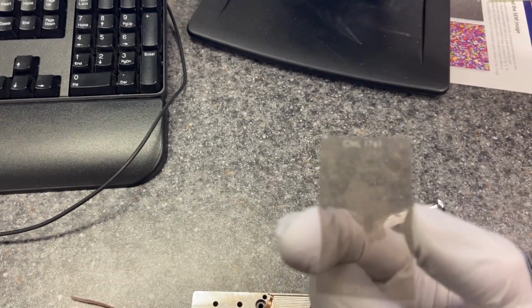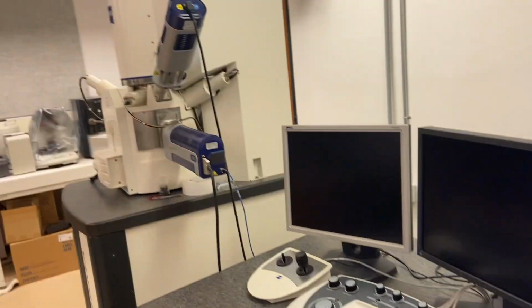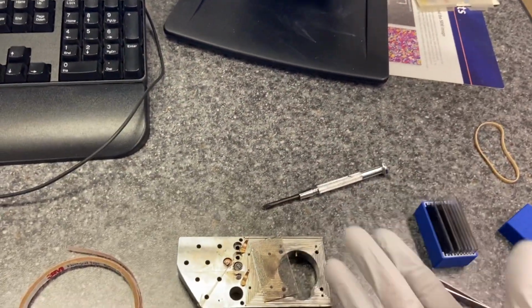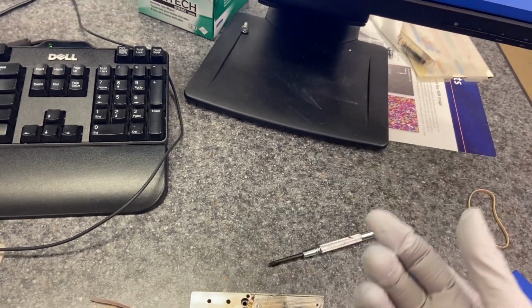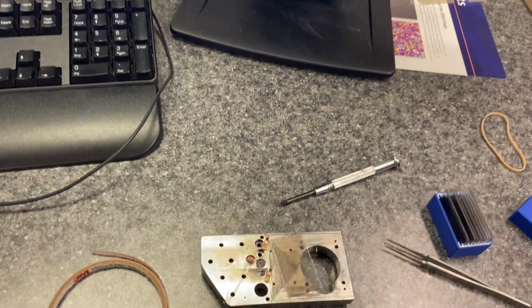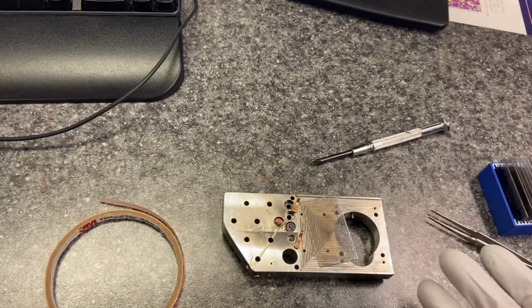So relative to regular thin sections that we look at in the petrographic microscope, once we're done doing that, we want to coat them with carbon prior to putting them in the SEM. And that's mainly because when you have electrons on a surface, if the surface isn't conductive, they're going to stick there and you're going to get what's called charging. And if you have too many electrons charging, you can get sputtering of material. If that material hits any of your detectors, you can cause a ton of issues and quite an expensive repair bill, which I definitely don't want to have.